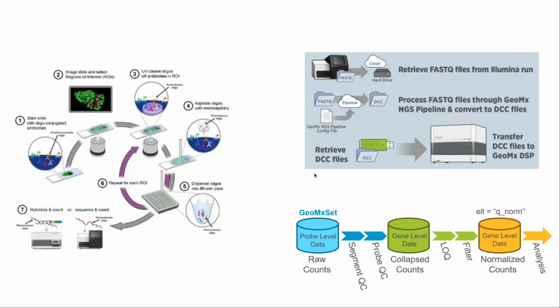But in our approach here at MoMA, we are very much into reproducible research. So we like instead to take out these counts and work with them in a compute environment such as the R language.